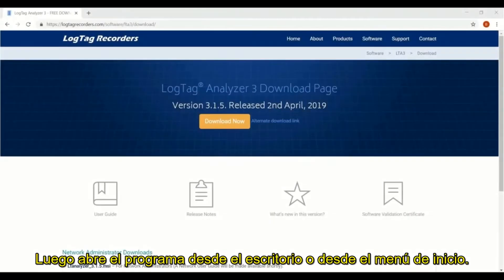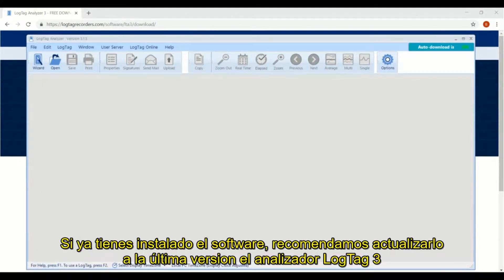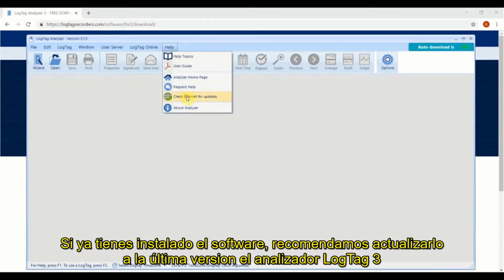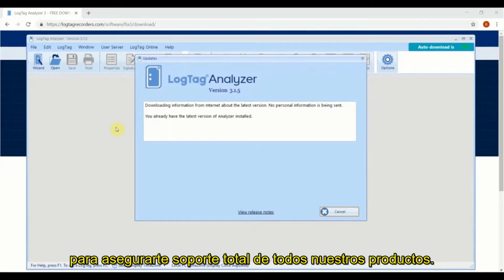Then open the software by clicking on the shortcut on your desktop or from the start menu. If you already have the software installed, we strongly recommend updating now to the latest version of LogTag Analyzer 3 to ensure full support of our latest products.